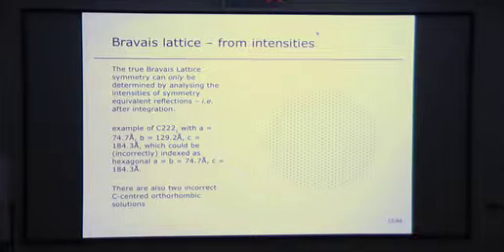From what is written on the right, you can see this should be orthorhombic C-centered, but from the distribution of the spots in space, there's no way of telling that at all. The only way you can tell this is if you look at the distribution of intensities of the spots.